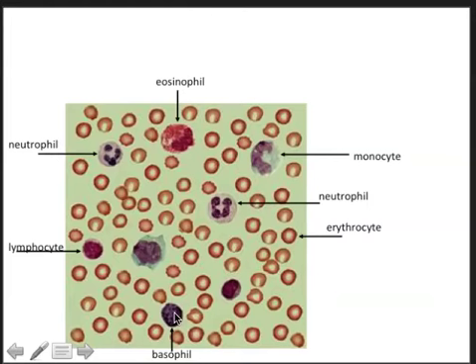So you can see all the different cell types here just contained in this one little smear. Okay, so again, lymphocyte, monocyte, eosinophil, neutrophil, basophil. Okay, another lymphocyte down there. The only thing you can't really see that well in this smear are the platelets, and again, they're extremely small and they lack organelles. But we've got some other examples of smears where you'll be able to pick these up relatively easily.